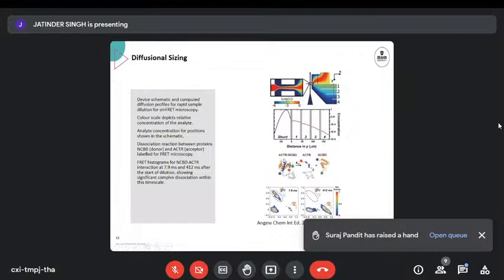So we've had the complex coming in. It falls apart into its separate components. Based on their different diffusion, these separate components end up in different outlets because they've got different diffusion constants. So we've got complex coming in here, separates into its different fractions. The larger one will end up in the first channel. The smaller they are, in a lower bin they end. In those bins, you can either in flow characterize them or collect the samples that are being collected.